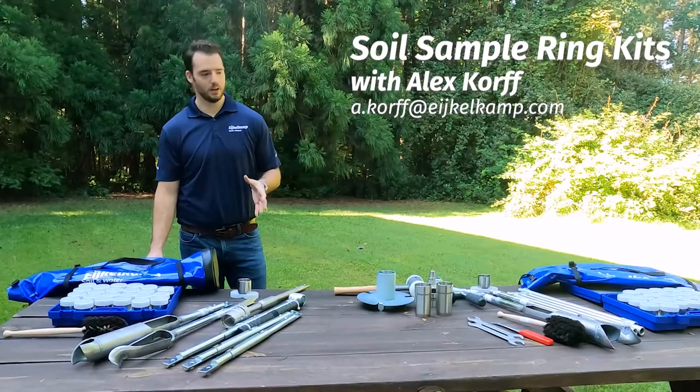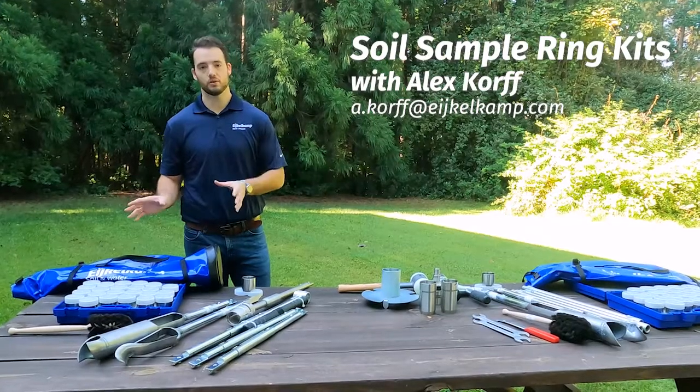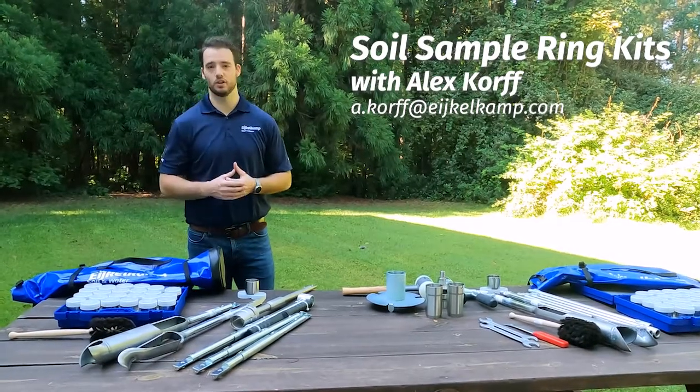Hi, this is Alex with Eijkelkamp North America and today we're going to talk about our two different sample ring kits — the soft soil versus the hard soil — and see what's different in each of these kits and how you're going to use them.